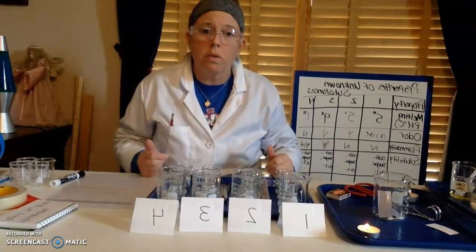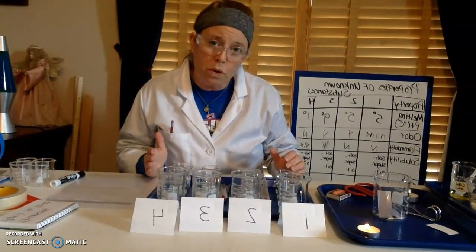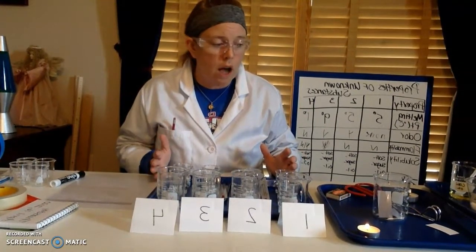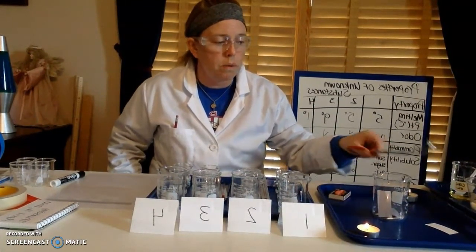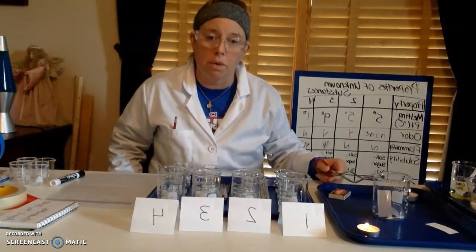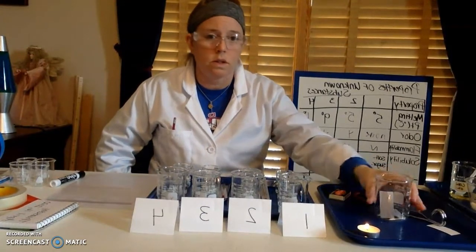All right, the next thing that we're going to do is conduct a solubility test. I hope that you're noticing that this is a review and that we are talking about some of those properties that we tested in the lab before we left on spring break. And so when we burn something, think about, is that a physical or a chemical property? Think about what I've told you. Does it change the substance?